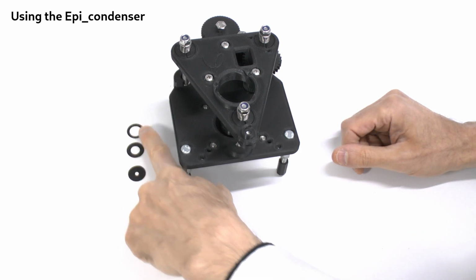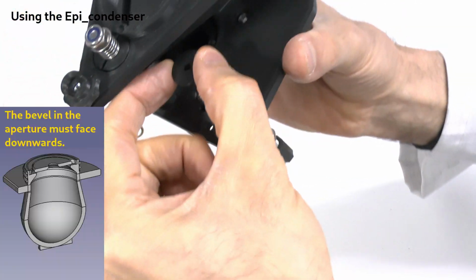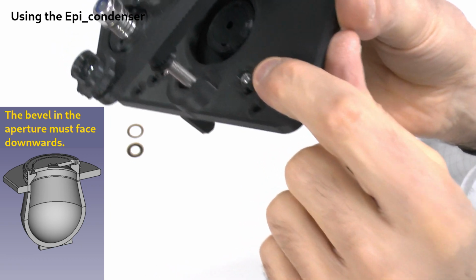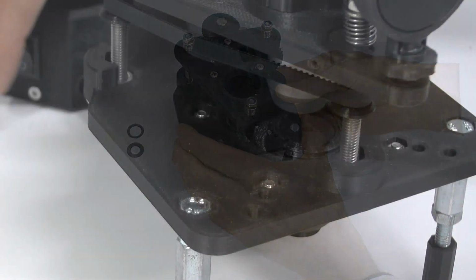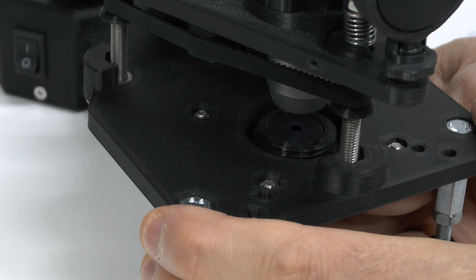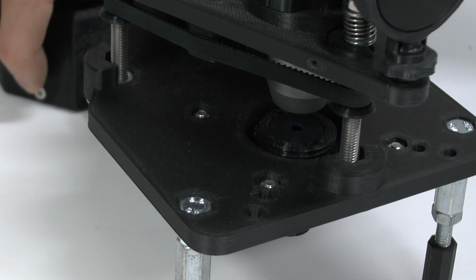To use it, you first choose a cover aperture that is just wider than the illuminating beam coming out of the objective. You then turn on the illuminator and center the epi-condenser until the light coming out of the objective is swallowed up by the black hole of the aperture. The epi-condenser is now correctly set up for use with that objective.